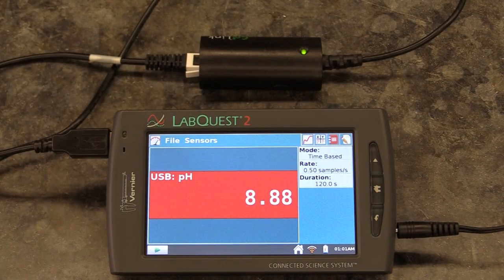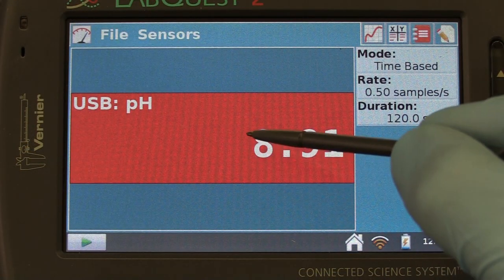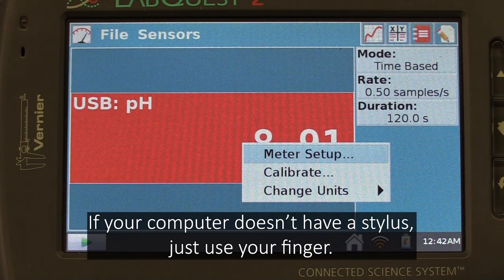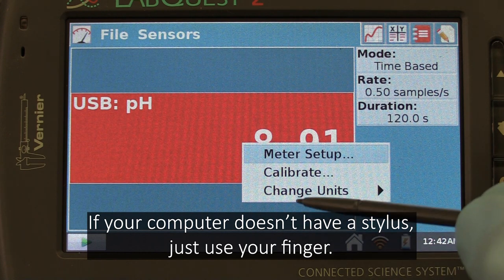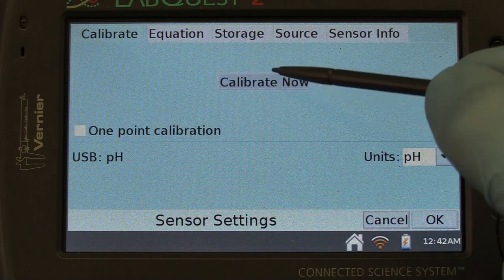As soon as you plug the probe in, a red box with a pH indication will appear on your screen. Use the stylus to click on it, then select Calibrate. On the screen it takes you to, select Calibrate Now.